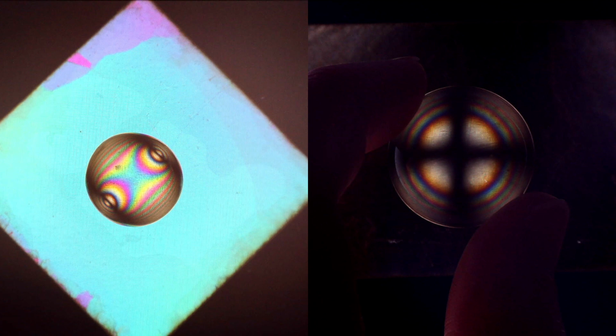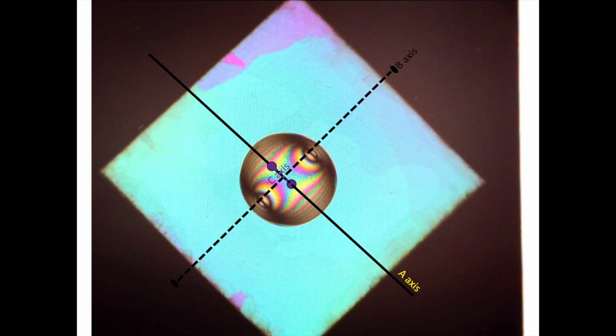With the BXA figure for our muscovite, we were actually able to use the melatopes of our muscovite to place the B crystallographic axis appropriately, thereby fully figuring out the crystallographic orientation of our muscovite. With our uniaxial optic axis interference figure for our Phlogopite, we don't have enough information from this to do something like that.